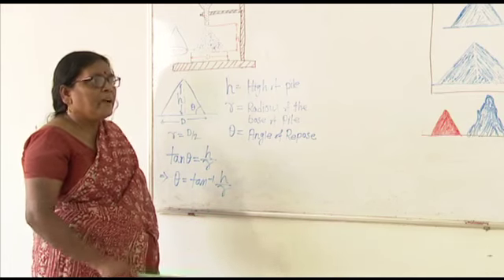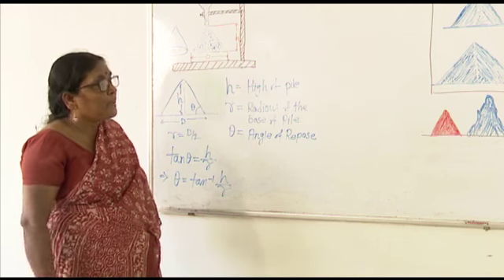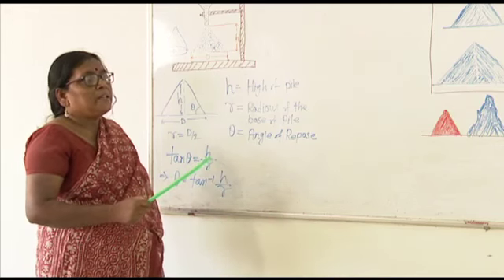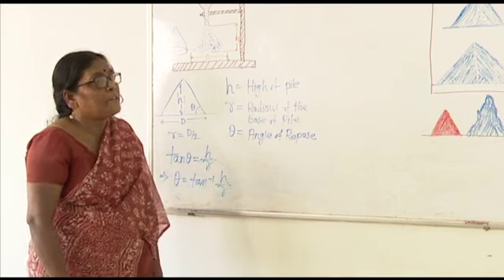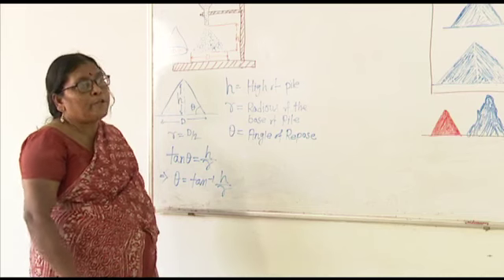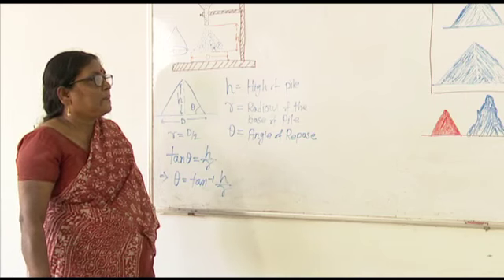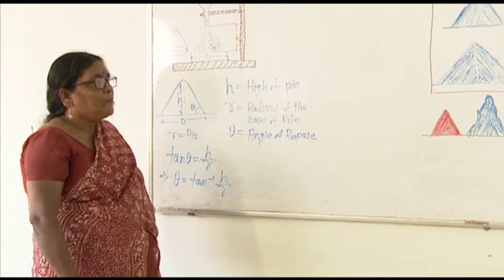So for drug excipients, we have to know whether they flow freely, whether they will mix freely, and we need to know their flowability or flow property. If the flow property is bad, we cannot use them as such. We have to modify them in a way so that they can mix thoroughly. And here comes the utility of the angle of repose.